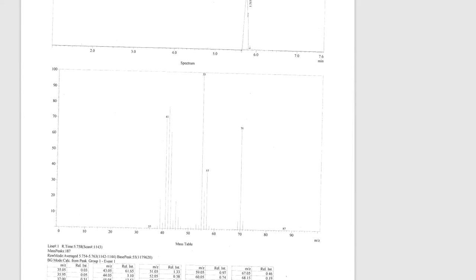Keep in mind, sometimes these things do funny things. And if you can get a fragment that's like 1 hydrogen off, then that's a pretty good sign that you're picking the right fragment. But not everything happens textbook. Not everything happens perfect. So if I can figure out a fragment that will give me 54 and not 55, I'm pretty close to where I need to be, unless something weird and strange is going on. So don't freak out about that. Don't think that you have to have a perfect number, because your number will be close. That's all that matters. All right?